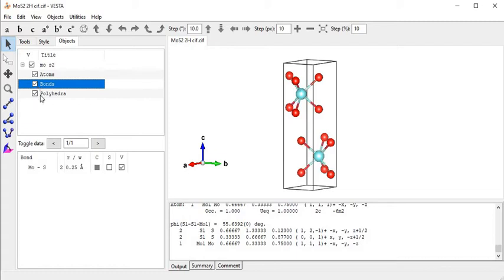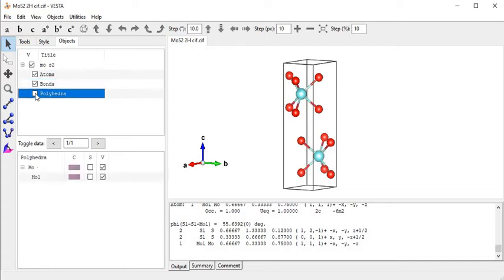This is the polyhedral option. I click on that part to toggle polyhedral display.